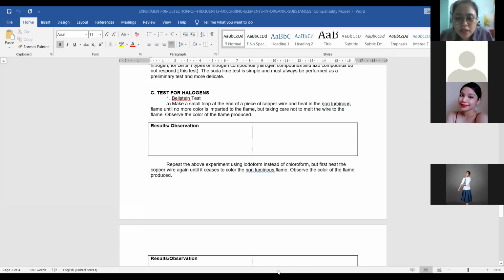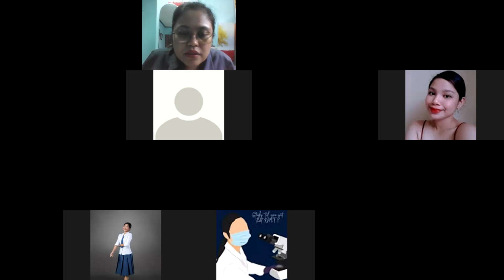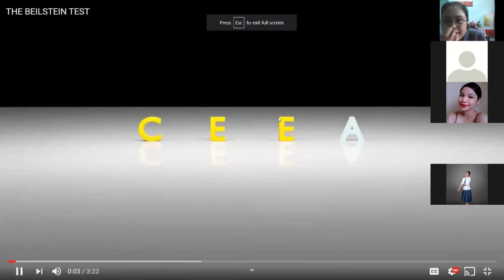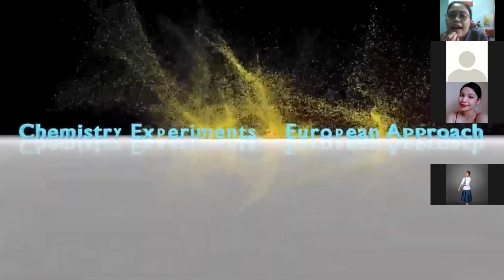It's actually a flame test. There is a video of it on YouTube. Let's see. Wait, let me open it, to see how it is tested. Let me stop sharing first. This one. So this is the Beilstein test to detect the presence of halogens.